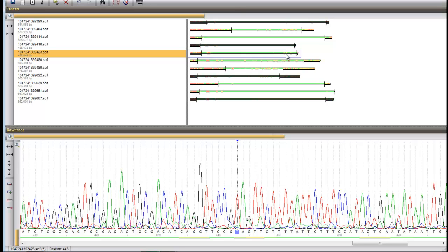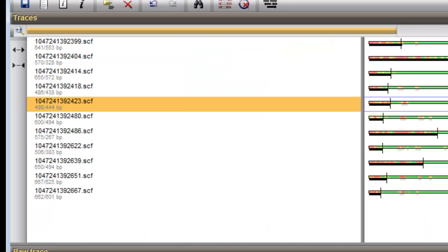These active or inactive regions can as well be added manually. Select a nucleotide or a range of nucleotides and press the button to activate or inactivate that nucleotide or region.